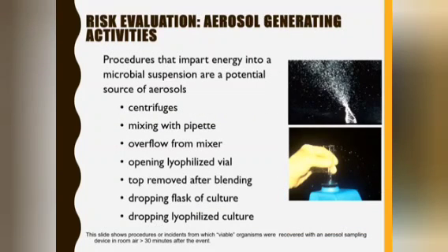Aerosol generating activities. Procedures that impart energy into a microbial suspension are a potential source of aerosols and must be critically looked at. Examples are centrifugation, mixing with pipettes, overflow from a mixer, opening lyophilized vials, removing the top after blending or vortexing, dropping a flask of culture, dropping lyophilized culture.